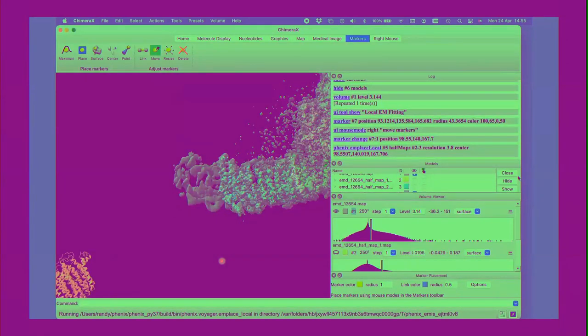So what it's doing is first cutting out the density in that region for the 2 half maps, comparing them, working out the signal strength and the noise strength to calculate the likelihood target, doing the rotation search, and then for the plausible orientations, doing a translation search. And for anything that comes up as a peak, it does the local docking refinement. And finally, it will move the model into the place that it's found, along with a map that you can look at, the likelihood weighted map.